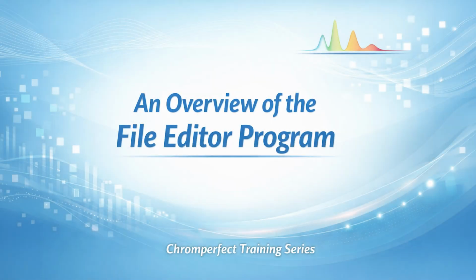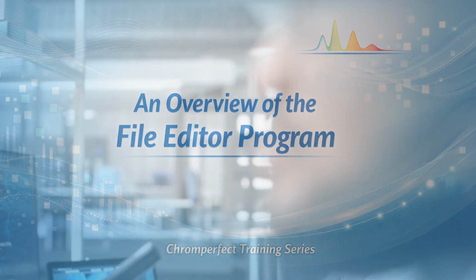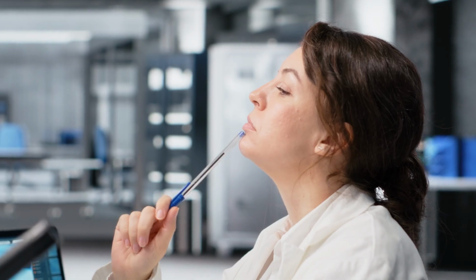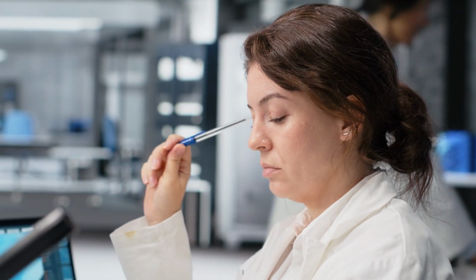Chromperfect Training Series, the File Editor Program. Introduction. In this video, we will introduce the File Editor program in Chromperfect. This presentation is targeted at new users.